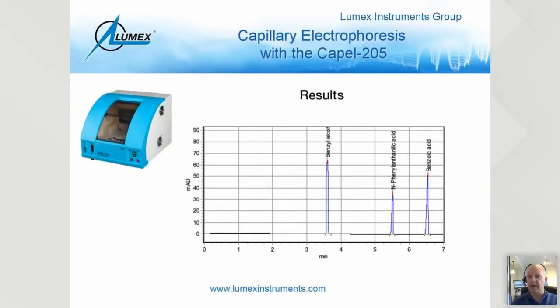As you remember, I was stacking all the runs together, and what I was seeing is an RSD that was very low, 0.5% RSD on migration time. What would happen is eventually, if you don't regenerate those capillary walls and you don't rinse properly, these peaks are going to start to move further away in the electrophoregram, so they won't come out at the expected migration times.